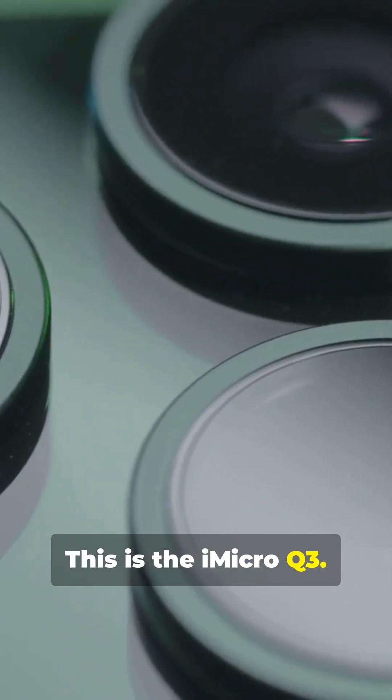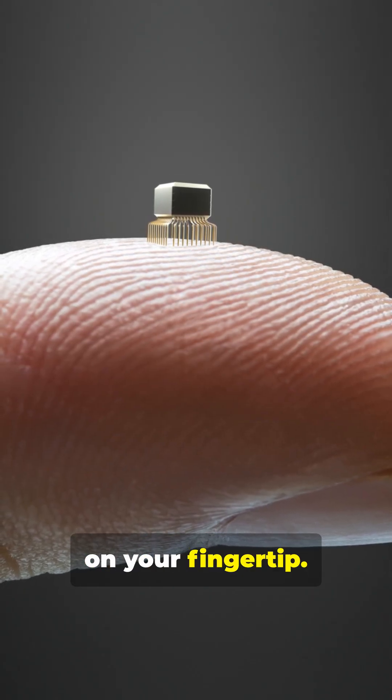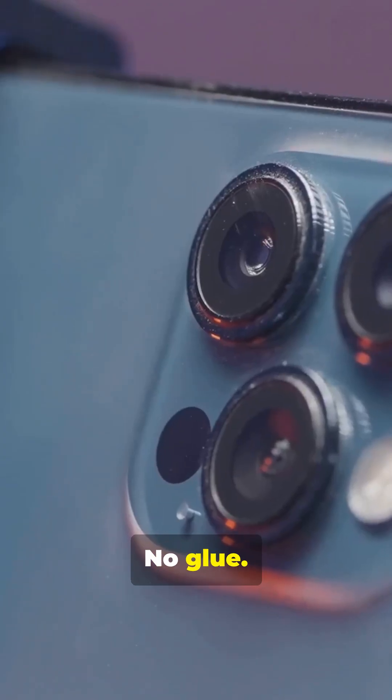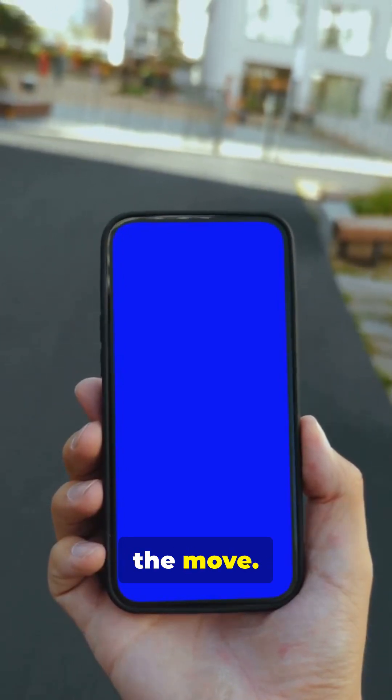This is the iMicro Q3 — a microscope so tiny, it literally fits on your fingertip. Thanks to its nano-suction pads, it just snaps onto your phone's camera and stays put. No glue, no sticky mess. It won't budge, even if you're on the move.